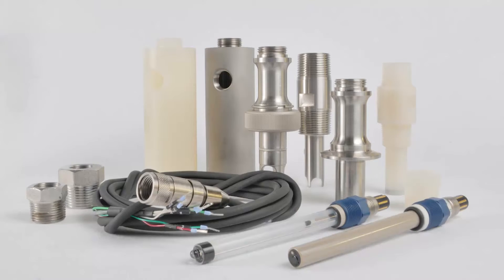It is also available with various mounting accessories, providing sanitary, ANSI flange, NPT, and retraction insertion configurations.